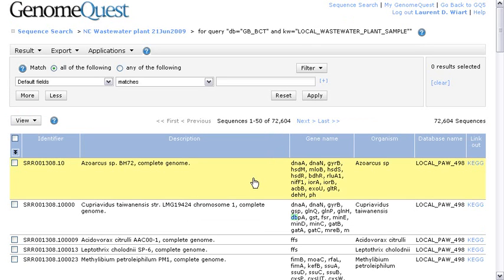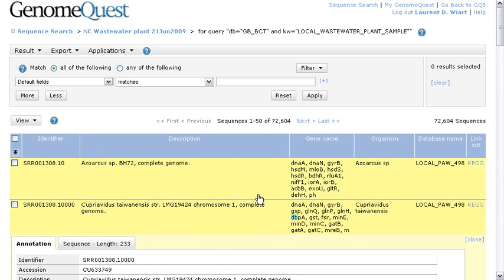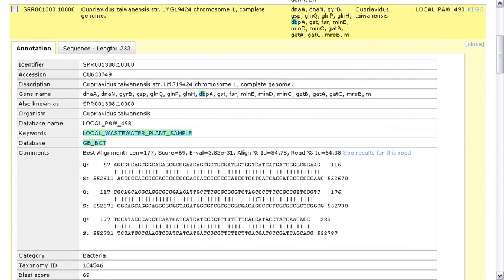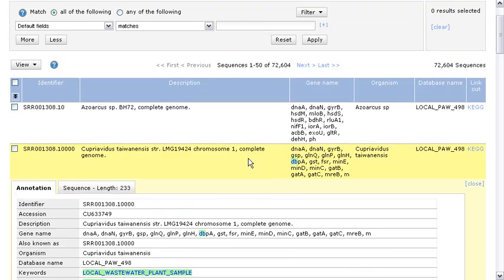And now you can see the description, the identifier, gene name if available, and I could expand the rows to have a look at the annotations as well as the evidence for this annotation. This is the alignment, the best alignment with some percentage, score, and E-value.